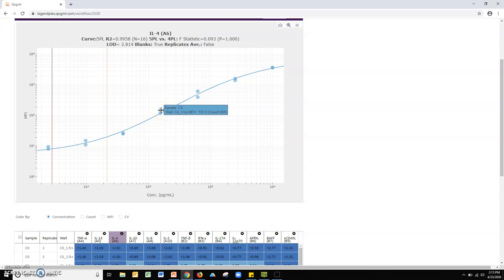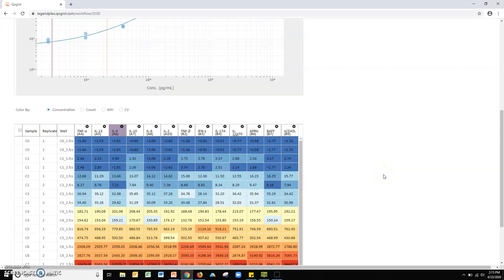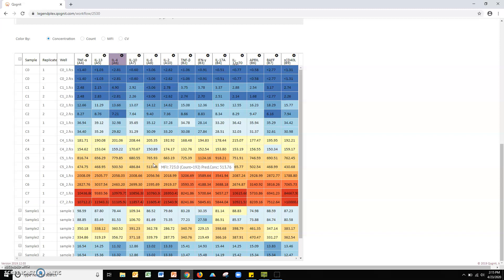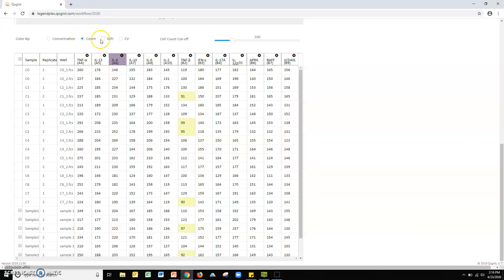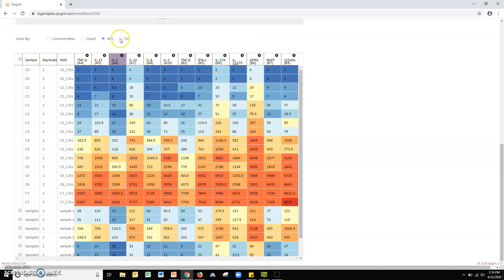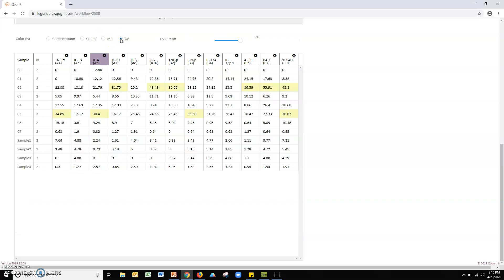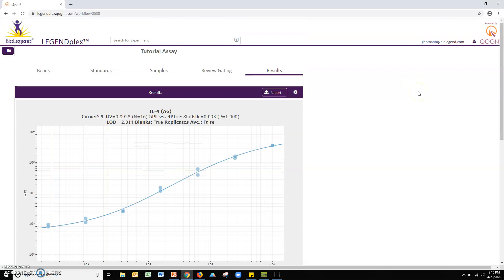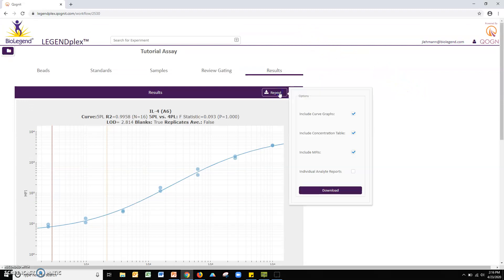The quantitation results are listed by analyte columns in the results table. You can toggle to the bead count, PEMFI, and replicate percent CV tables by clicking their respective circles. When finished, click the report button to download your LegendPlex assay data into an Excel report.